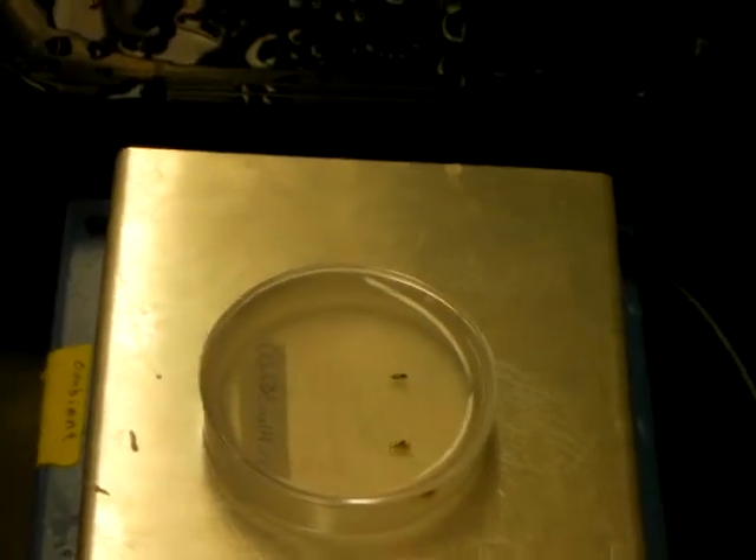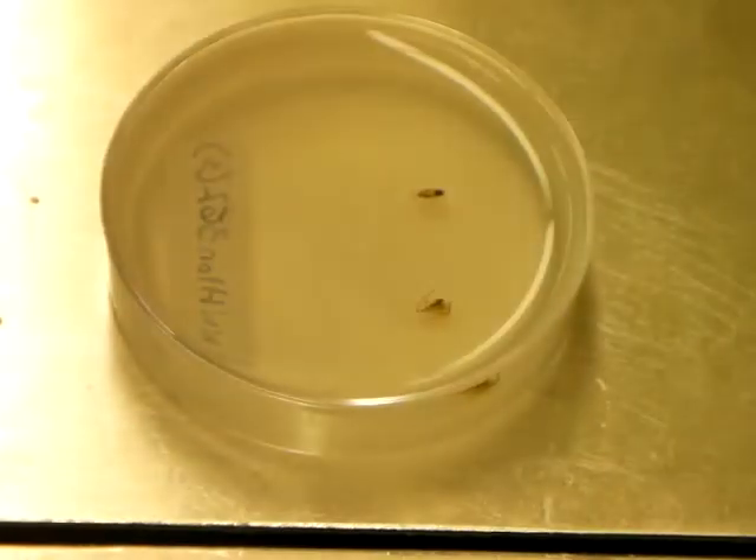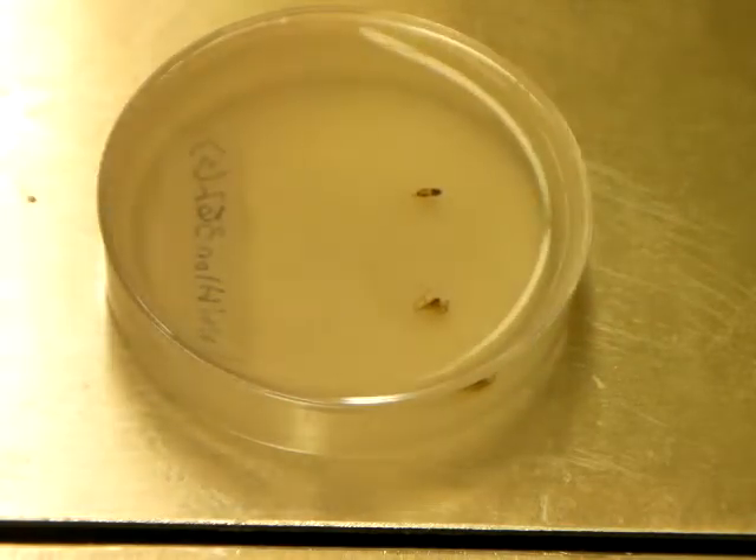Let's just angle this so you can get a better shot of it. We've got some solidification of the paraffin going on here. I'm going to flash the top.